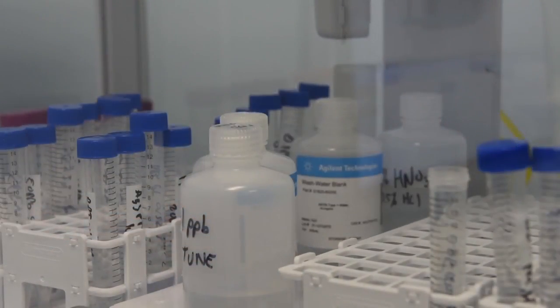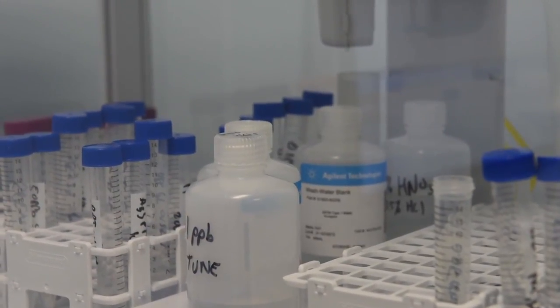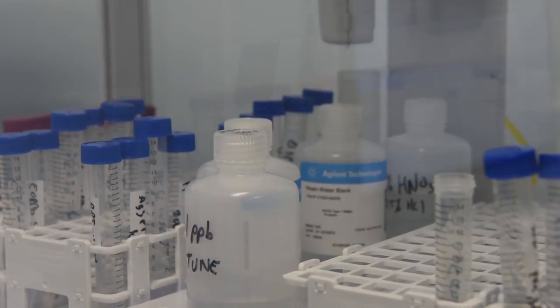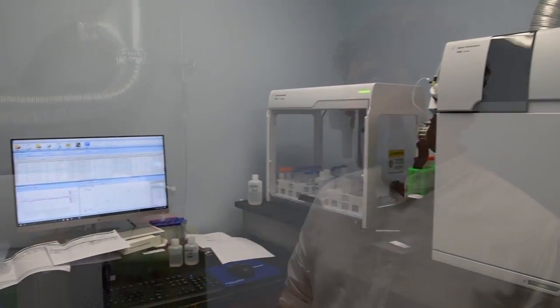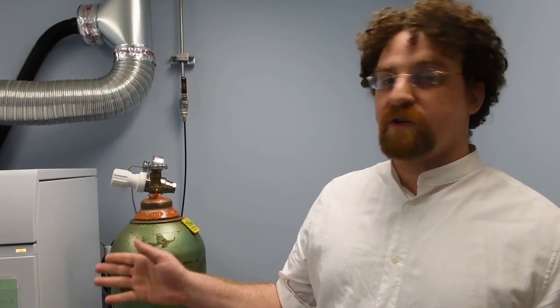Here it's a much more aggressive sample introduction system. To get metals out of material, you break them down in corrosive solvents like acids, then take that extract and introduce it into an argon plasma that's sitting at 6,000 degrees, which is the temperature of the surface of the sun.